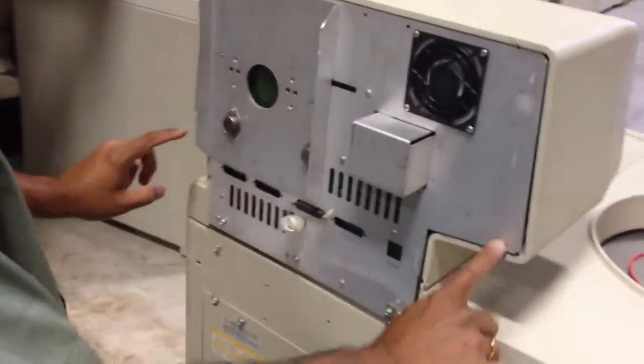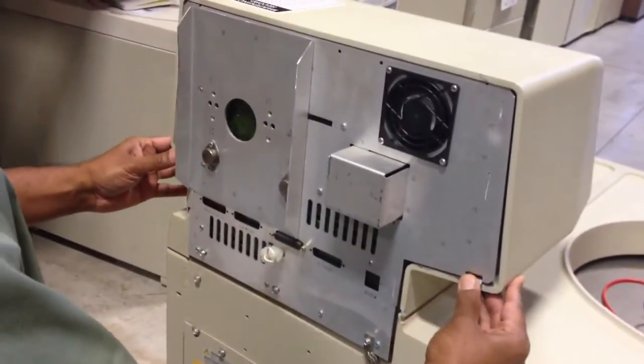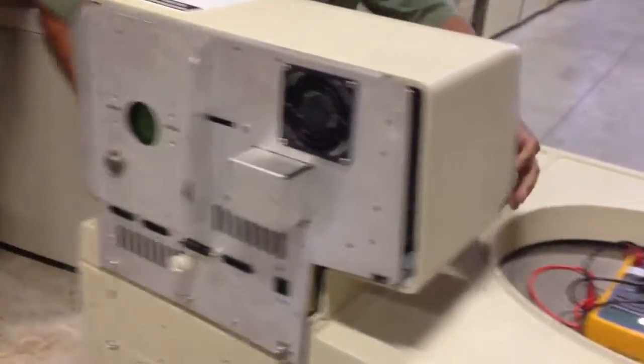Now you see these two tabs here — tab one and two. Just press it and push this forward. Basically you are able to get this panel off.